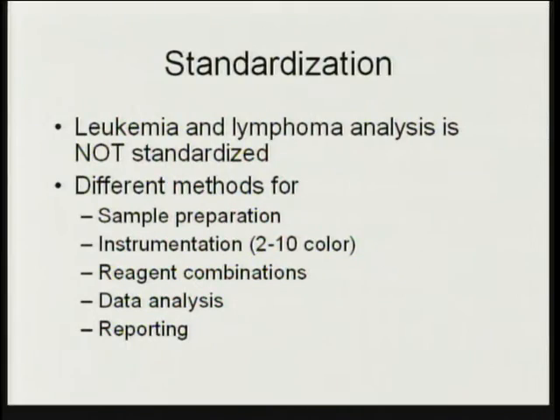This brings up the issue of standardization as well. At this point, leukemia and lymphoma evaluation is by no means standardized. In fact, it's very not standardized across the country and across the world. Different methodologies are used for sample preparation. The instrumentation that's used ranges anywhere from 2 to now 10 color. Different reagent combinations are used. Different methods of data analysis and reporting are performed.